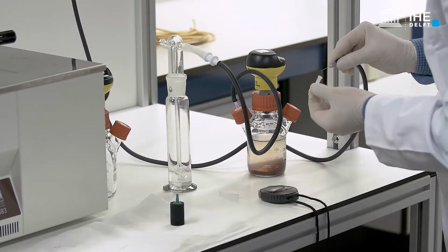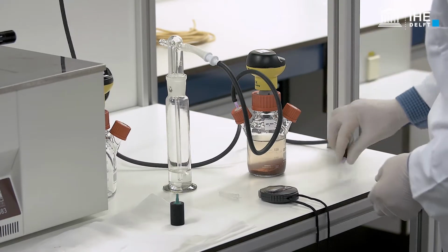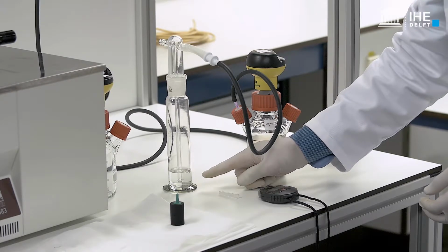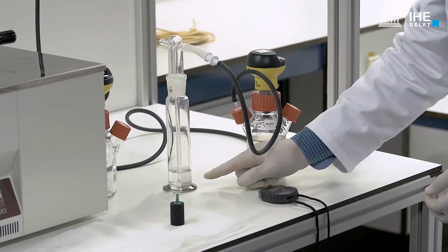After the nitrogen gas supply has been disconnected, wait until gas bubbles stop rising in the water lock, meaning that the pressure in the headspace has been equalised to the atmospheric pressure.